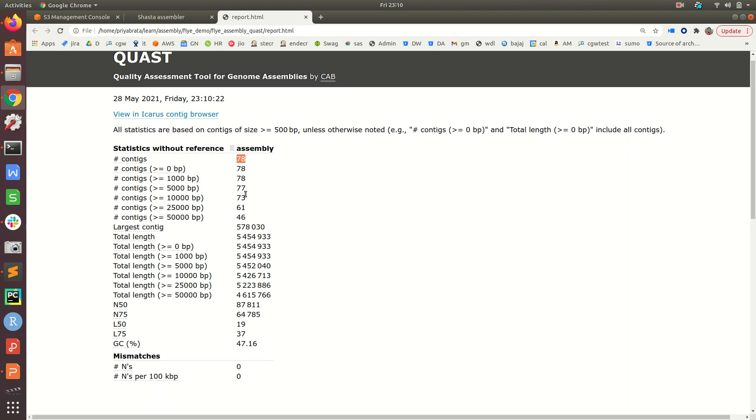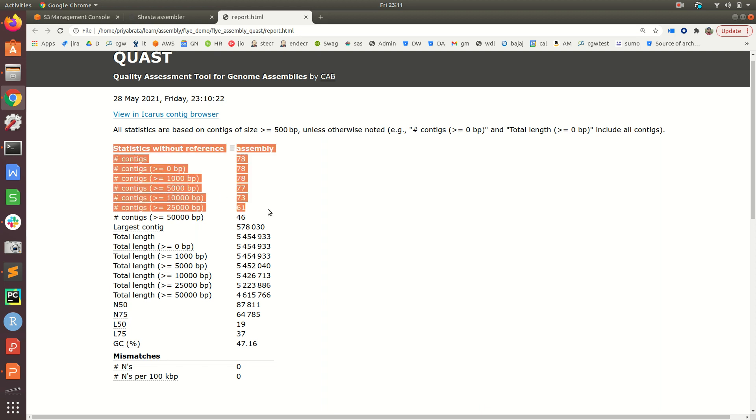There are around 78 contigs. If we apply different base pair thresholds, the number of contigs will change. For example, there are 73 contigs having size greater than 10,000 base pairs, and 61 contigs greater than or equal to 25,000 base pairs.